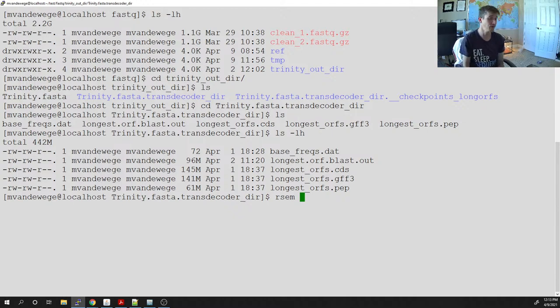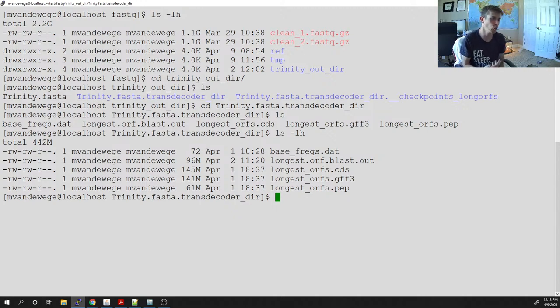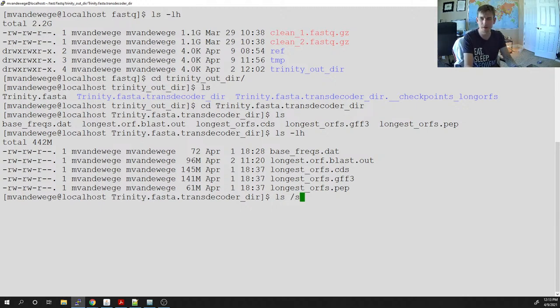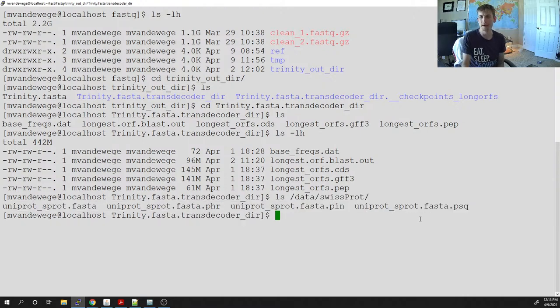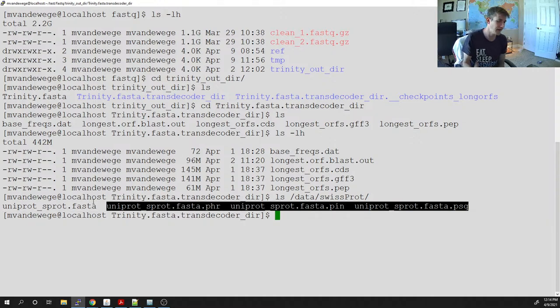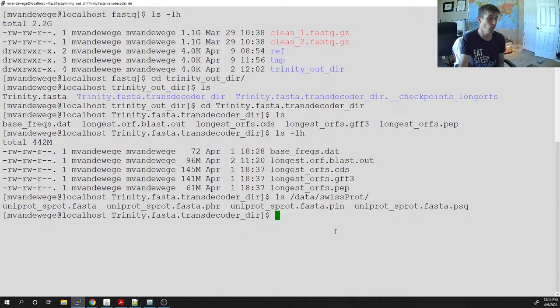Whenever we run RSEM, we have to break it into two steps. First, we have to index our reference — if we just try to map reads to the reference CDS sequences, it won't work. We have to create indices or additional files. You do the same thing before running BLAST. In the SwissProt database, there are additional .phr, .pin, and .psq files that BLAST actually reads. Bowtie does the same thing — we have to create indices that Bowtie can read.